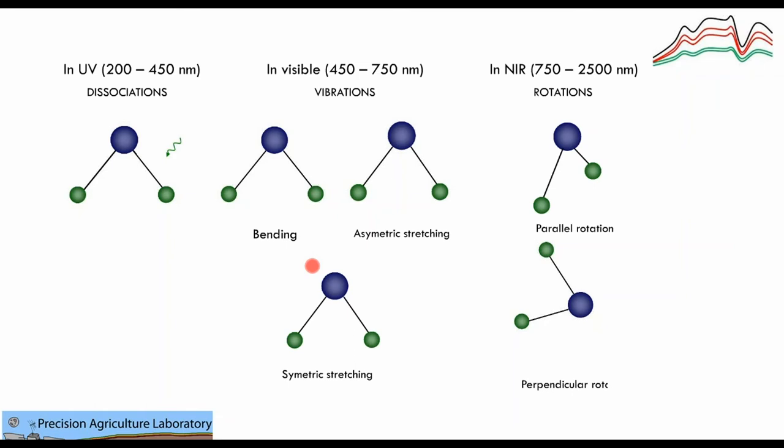And this is a crucial thing, because knowing that different qualities of light react in a different way with matter, the analysis will be different. So the analysis of, let's say, middle infrared spectroscopy will be different than the analysis in the near infrared part of the spectrum, and also in the analysis of the ultraviolet part of the spectrum, okay? But this is the important thing so you have a framework. We have different parts of light, they have different frequencies, they have different energies, and the matter reacts in different ways depending on the type of wave that we are treating.